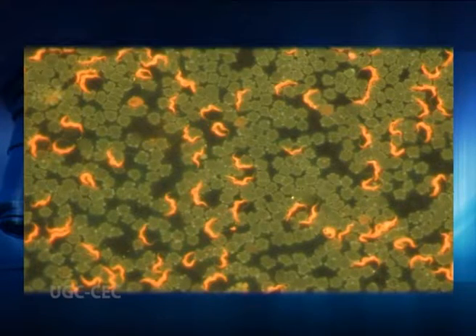Auramine differential staining for acid-fast bacilli is one application of the technique. Rapid diagnostic kits have been developed using fluorescent antibodies for identifying many pathogens. Remember, microscopes can be made more sophisticated with additional accessories for ease and superiority in functioning.